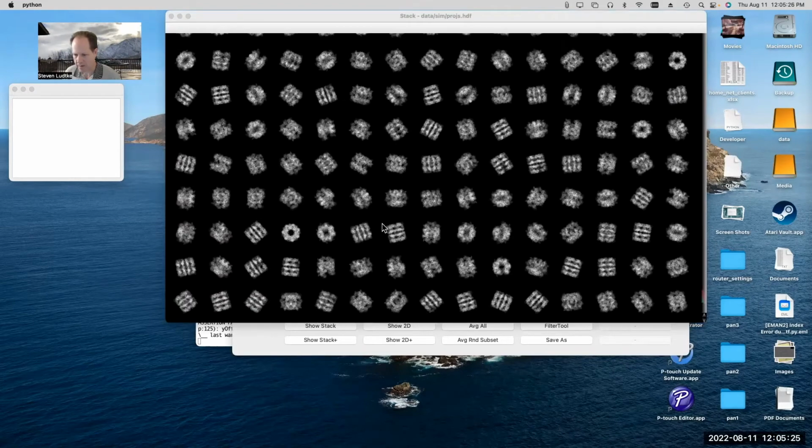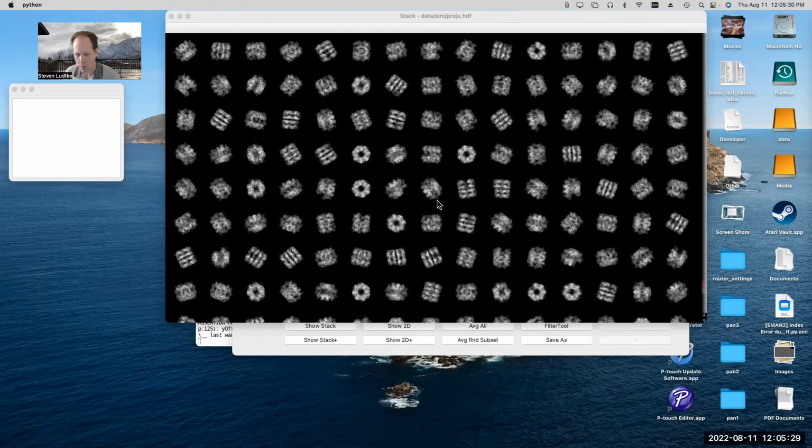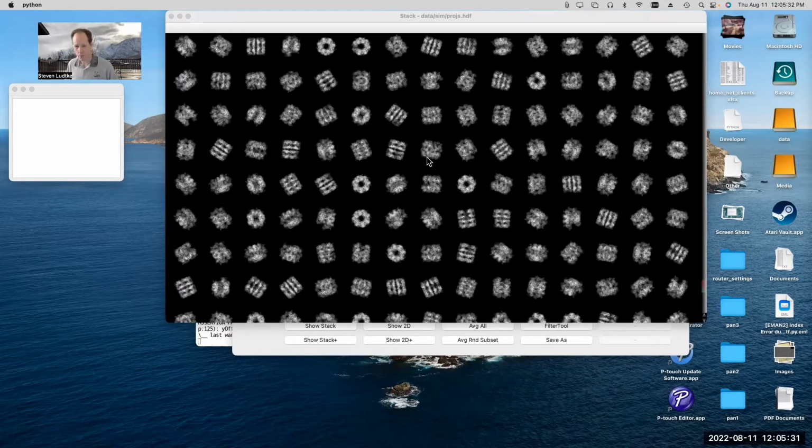Now, we didn't do anything about centering. I didn't shift them in the box. If our goal was to make data to test our ability to do a normal reconstruction, then I probably would have done some random translations before we added noise. But in this case, since our goal is to look at dynamics, and we're just testing with simulated data, we might as well leave it well centered at the beginning, rather than artificially adding that step to the process.